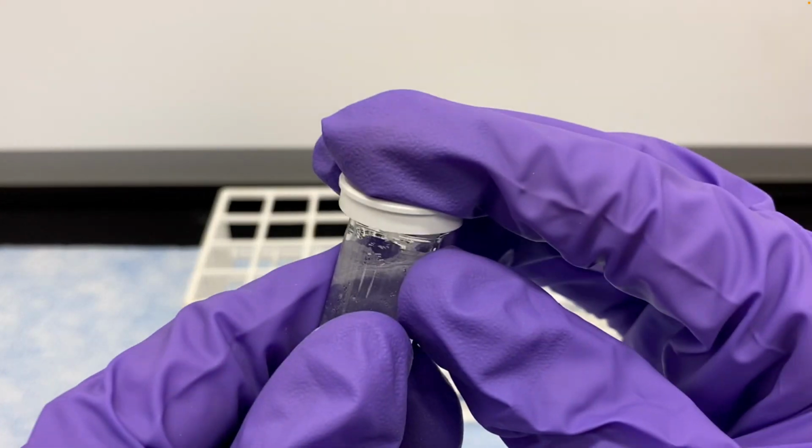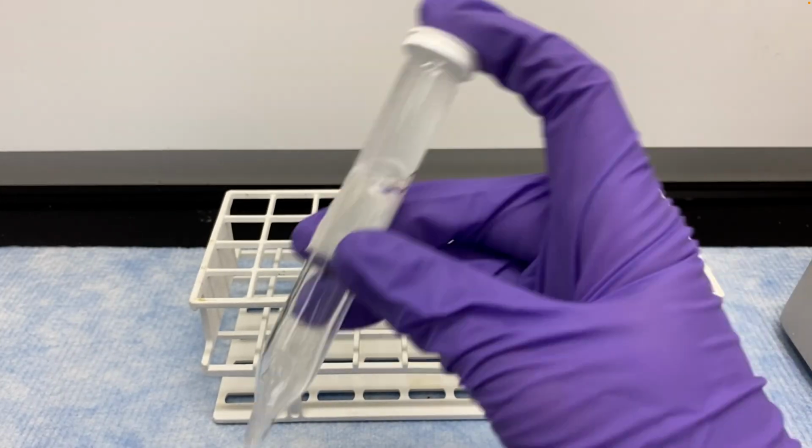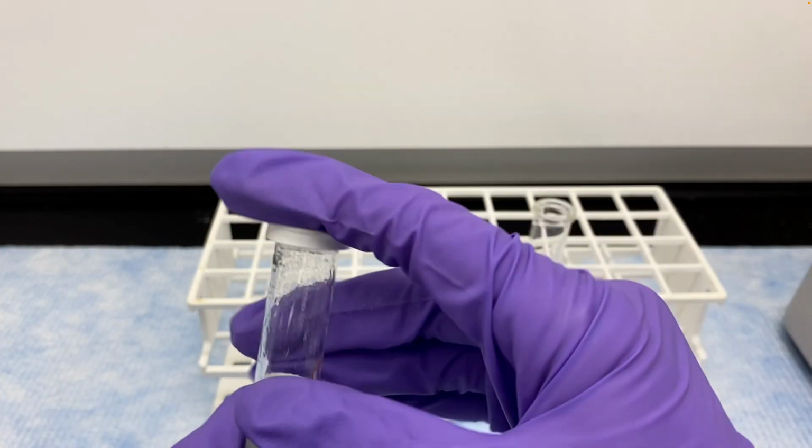So now we do the extraction. In this test tube, there's the watery solution from the round bottom flask, and now there's the ethyl acetate we just used to clean out the flask. The camphor is going to want to dissolve in that ethyl acetate, which will be a separate layer. Both ethyl acetate and water are clear, so it's a little difficult to see the two layers, but you can see them in the lab.